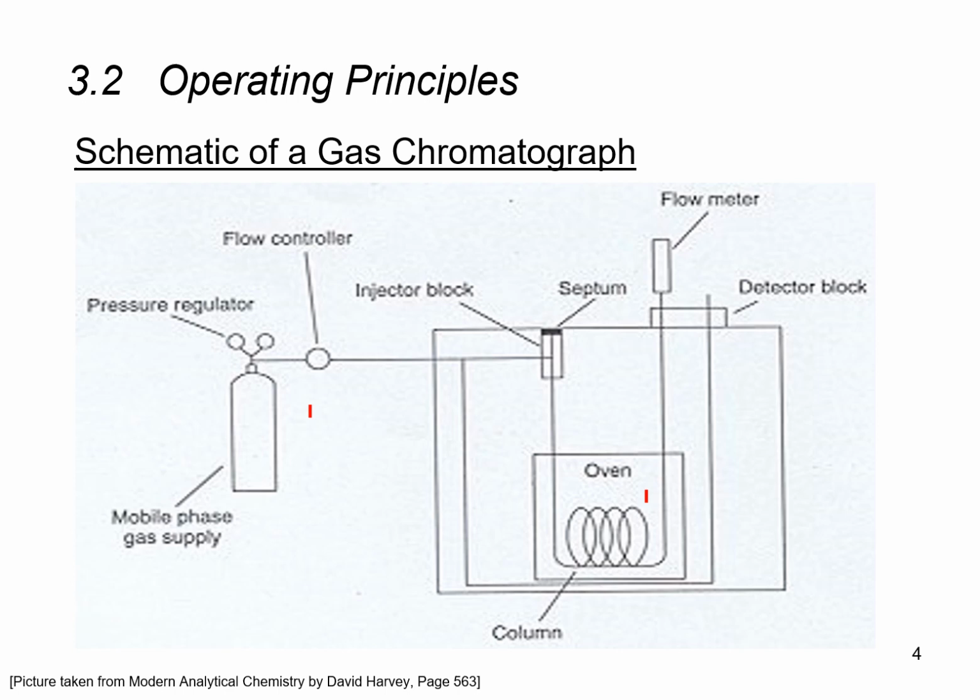So as the mixture travels through the column, the different chemical components of the sample mixture will start interacting with the column, and of course some will interact more and some will interact less, and therefore the various chemical components will start being separated, very similar to what we saw in the previous slide, and they will therefore leave the column at different times.